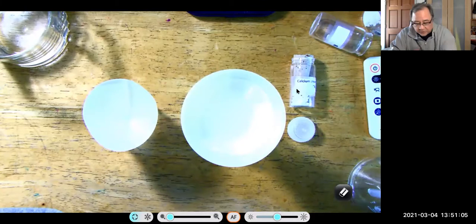And hopefully this will dry out. If it doesn't dry out, I can heat it again. So at 200 degrees Fahrenheit, the paper should not ignite. Paper ignites at like 400 to 500 degrees Fahrenheit. So the paper should dry out.